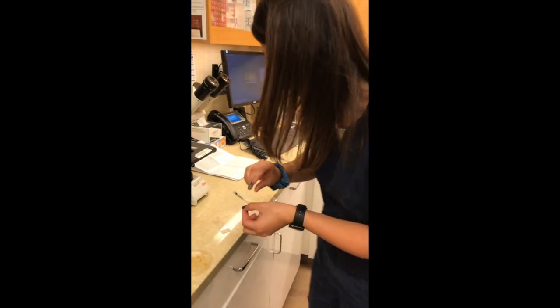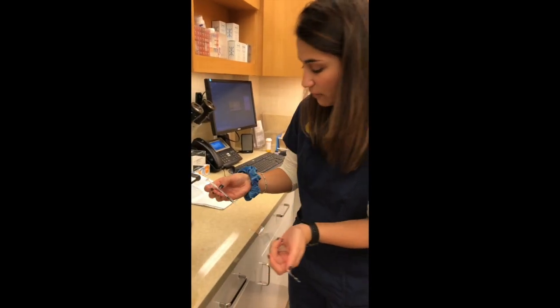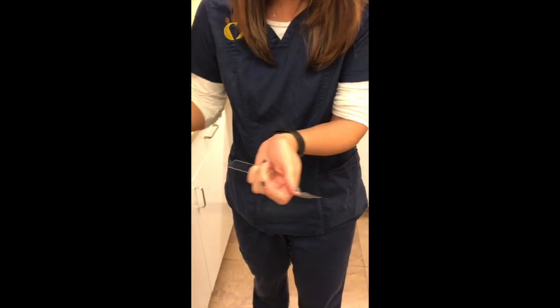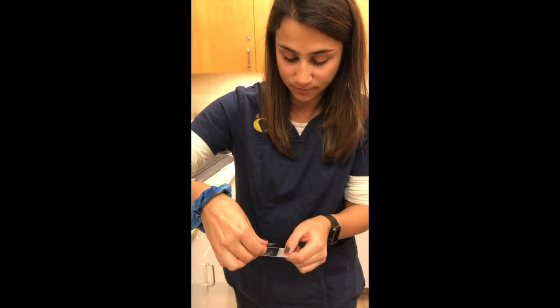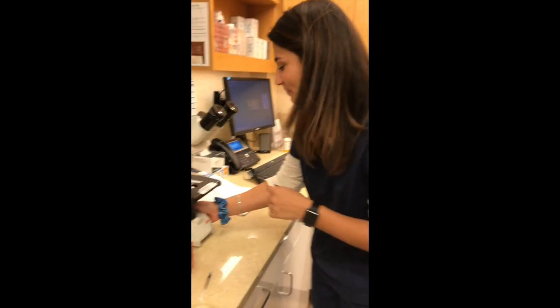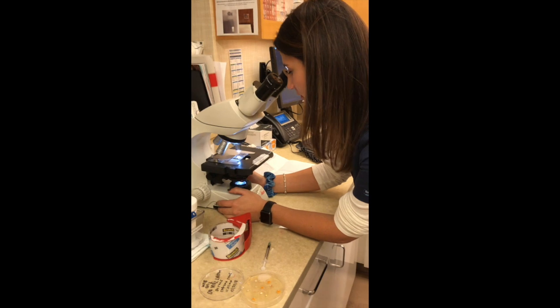Perfect. And now I'm going to add a drop of our lactophenol blue stain onto our slide, just like that. And then I'm going to stick the tape directly down, sticky side down. And now I'm going to take a look. So in conclusion, there were rods, but there were no dermatophytes that I saw.